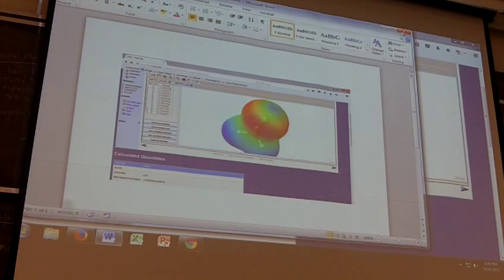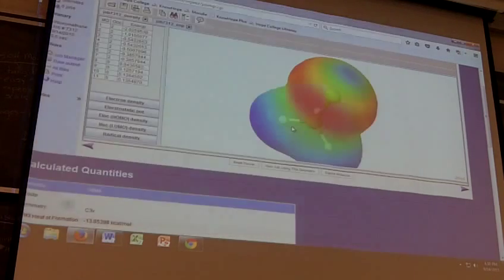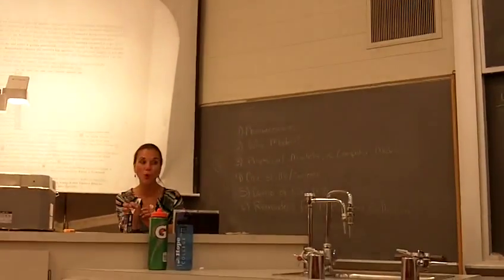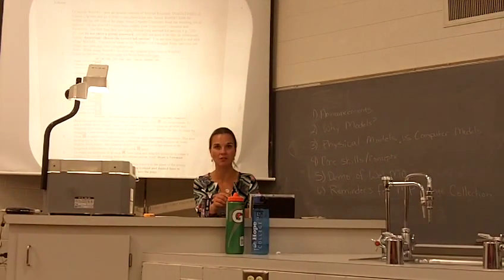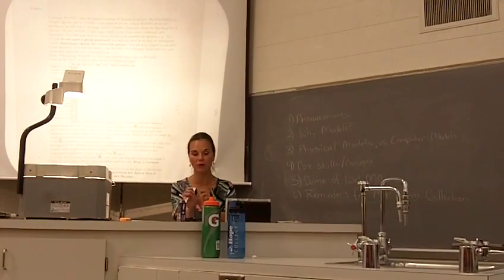Okay. All right. One more thing that I wanted to mention. Make sure when you're collecting melting points, we talked about it a little bit last week, that you're always collecting the range, where it first starts melting a solid and where it ends melting, okay? So you don't want the melting point, you want the range for that solid melting. Make sure with the melting points you're collecting melting point ranges.